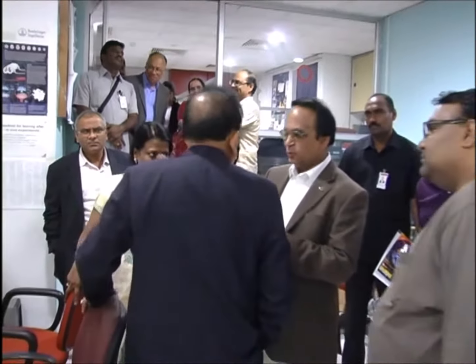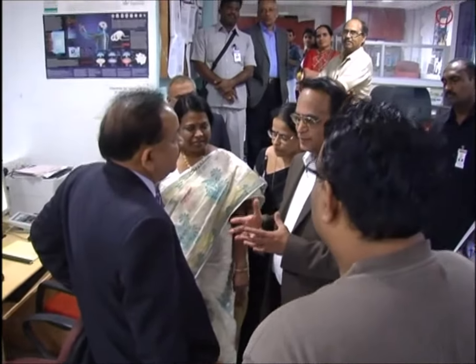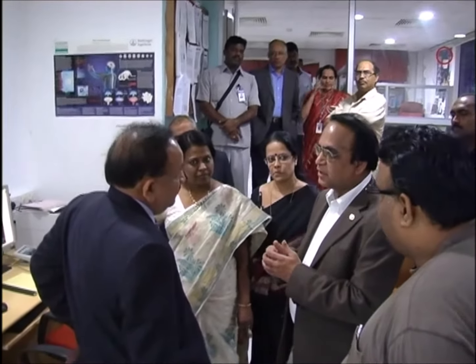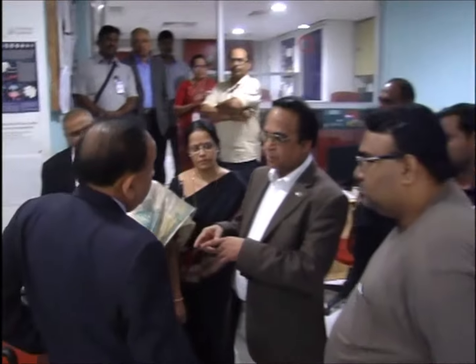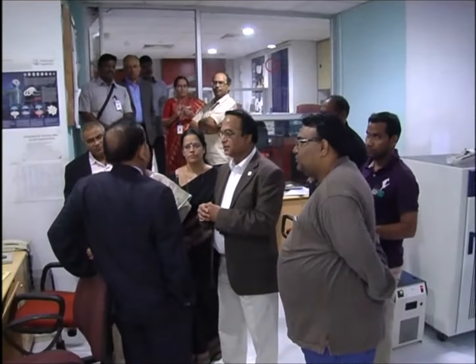One of the applications we are just coming to is Alzheimer's disease. There is no diagnosis for Alzheimer's disease. In Alzheimer's disease, the glucose metabolism rate is changing even before the disease comes up. So by studying the glucose metabolism rate with NMR spectroscopy, one can predict that after 5-6 years you might get the disease.